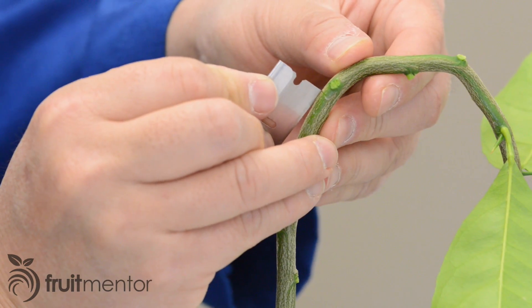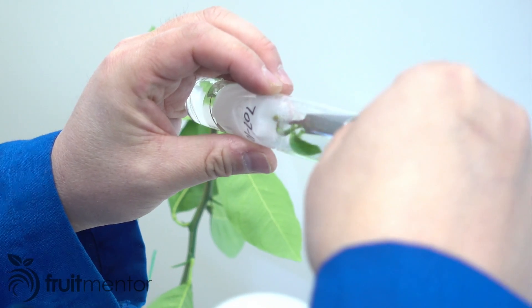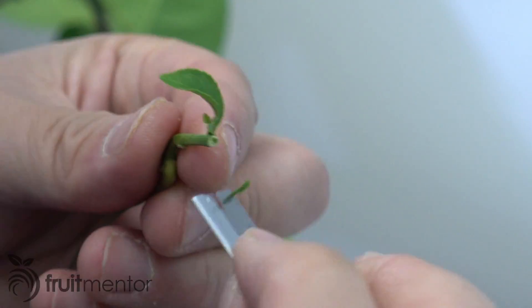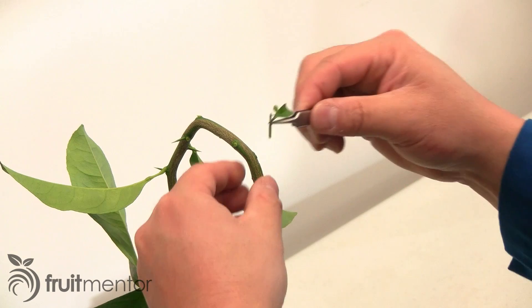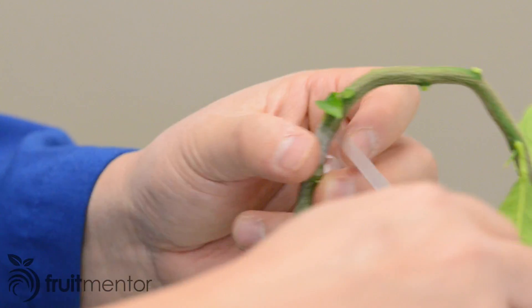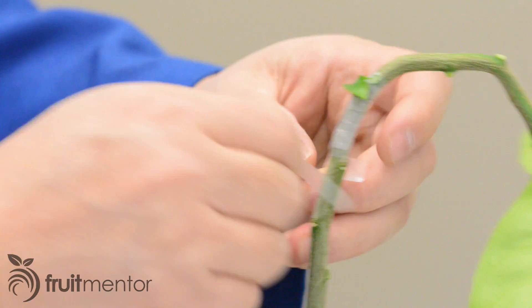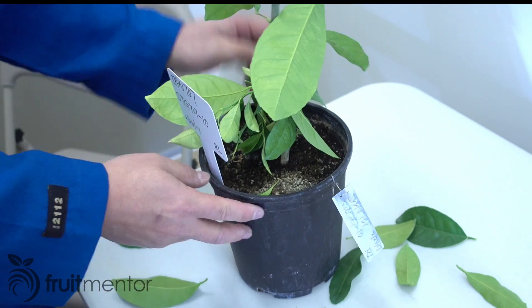Next, a T-shaped incision is cut into the lemon seedling. Then the tiny tree of the introduced variety is removed from the test tube and any rootstock suckers are removed. A cut is made on the rootstock part of the tiny tree. The rootstock part of the tiny tree is then inserted into the incision on the lemon seedling to make a double graft. The graft is wrapped very carefully with grafting tape to avoid breaking the soft tiny tree. An easy-to-read label and a securely fastened label are both added to the container.